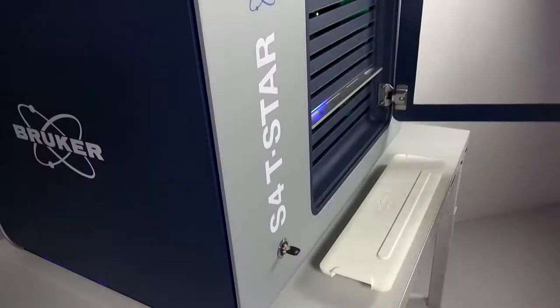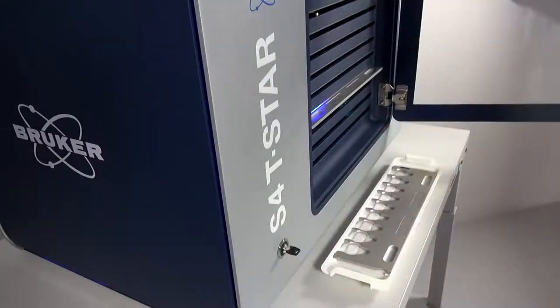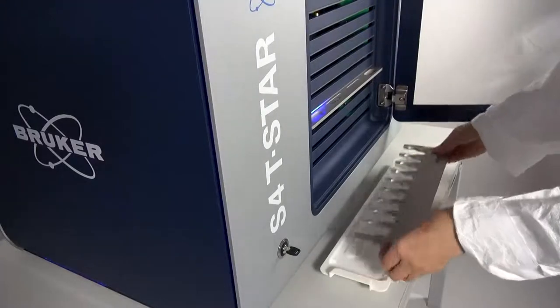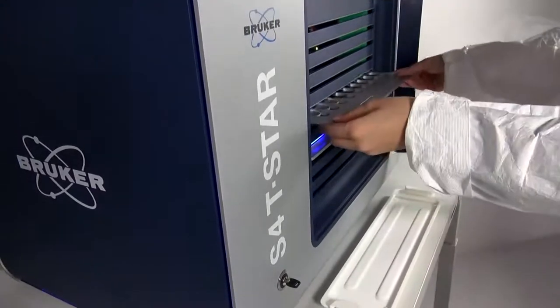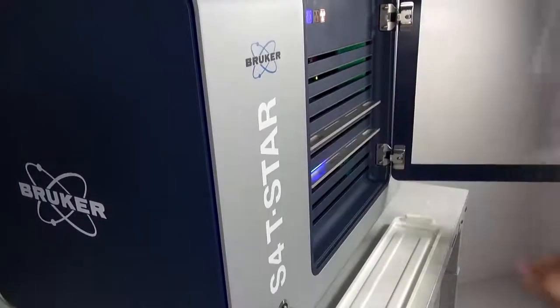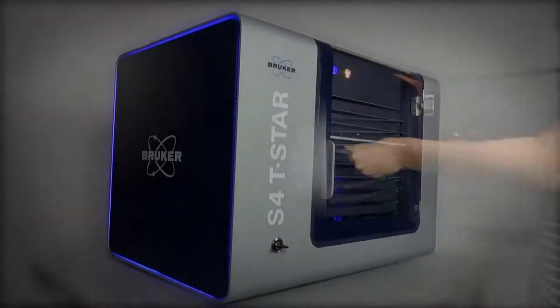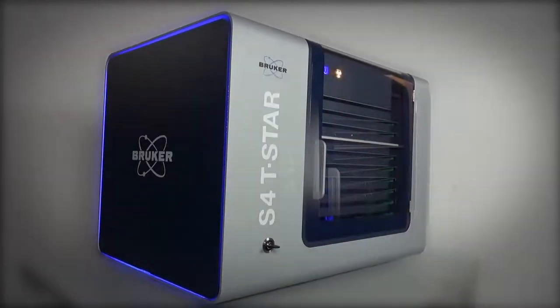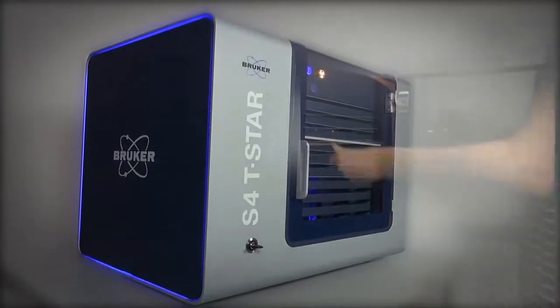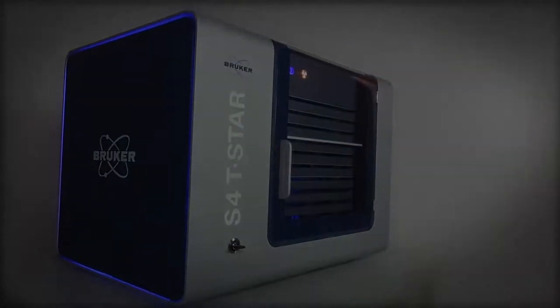The S4 TSTAR is dedicated for continuous 24-7 multi-user operation in industrial routine analysis. Therefore, automated batch processing is supported as well as unattended operation, for example overnight.